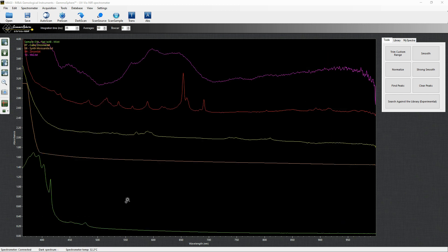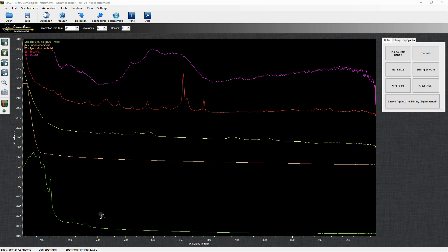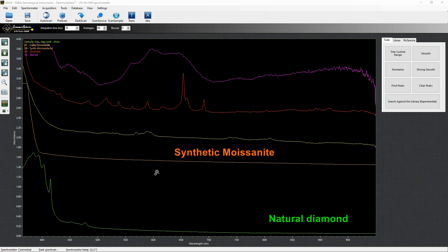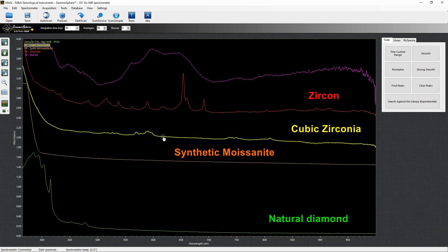The Gemosphere software allows to visualize up to 50 spectra at the same time. Here you can see the spectra of a natural diamond and some of its simulants like synthetic moissanite, cubic zirconia, zircon, and yag.